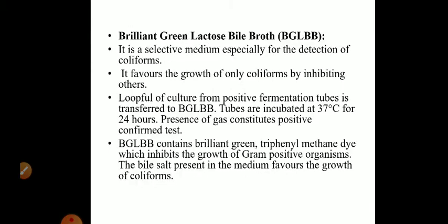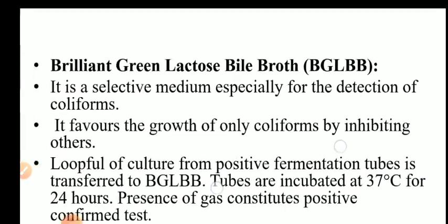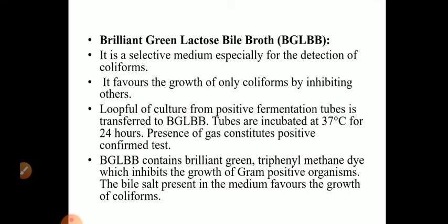Now, what is brilliant green lactose bile broth? It's a selective medium, especially used for the detection of coliforms. It favors the growth of only coliforms by inhibiting others. A loopful of culture from the positive presumptive tube is inoculated into BGLBB, incubated, and checked for the presence of gas production. If gas is produced, coliforms are present.